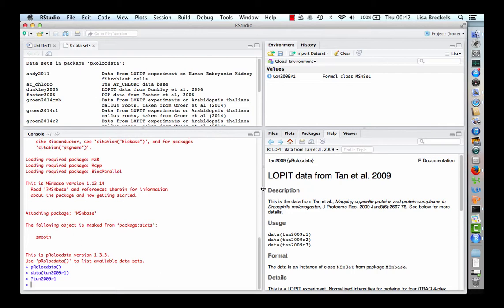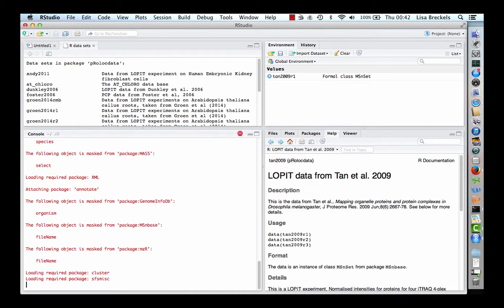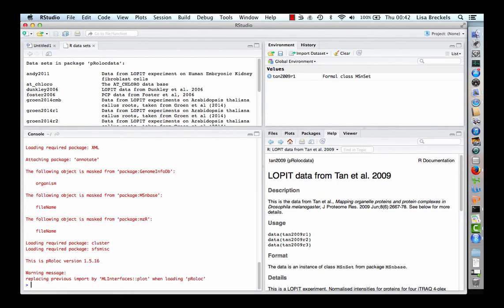Now we are ready to start exploring the dataset using ProLock GUI. Let us load ProLock GUI again by typing library, then ProLock GUI. This loads the ProLock GUI package. Now to visualise the data, we use the ProLock GUI function. Type ProLock GUI followed by the name of the dataset.